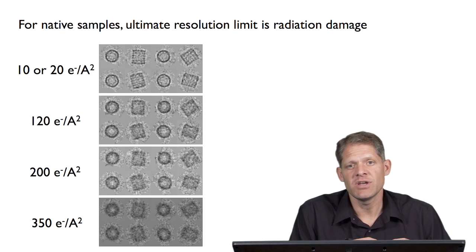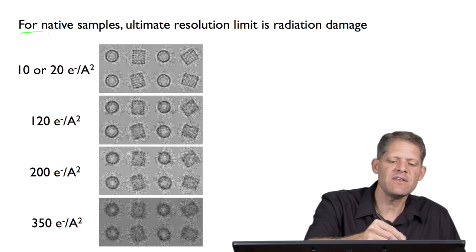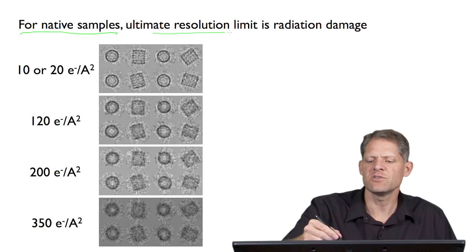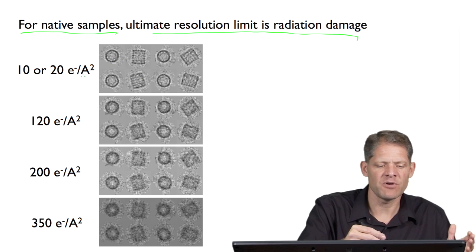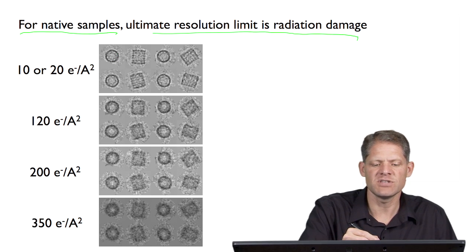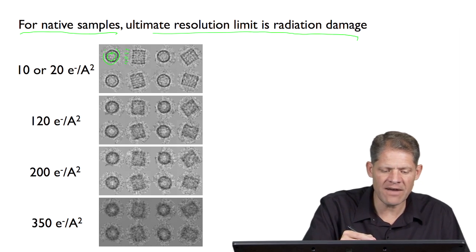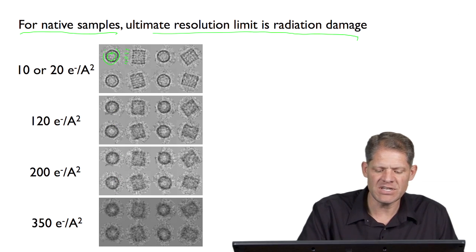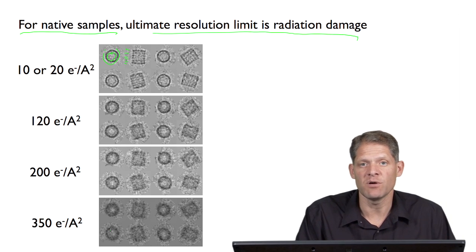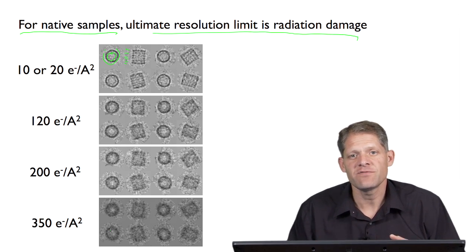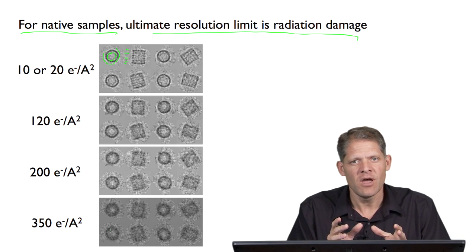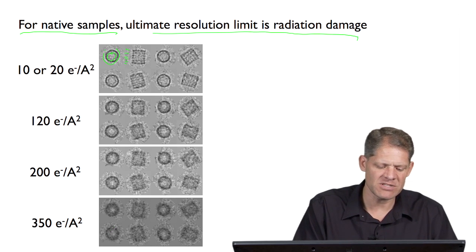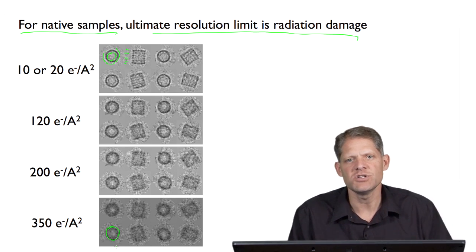The ultimate resolution limitation in tomography depends on what kind of sample we're imaging. For native samples, frozen hydrated material, the ultimate resolution limit is radiation damage. I showed earlier a series of hemocyanin molecules — after imaging with just tens of electrons per square angstrom, you could still see they were barrel-shaped, see the inner ring, and that they were stacks of six layers. But after applying 100 or even 200 electrons per square angstrom, those details were lost. The rough outlines of the particles were still present, but we can't fire enough electrons to get high-resolution detail before destroying the sample — leaving only blurry, lower-resolution remnants.